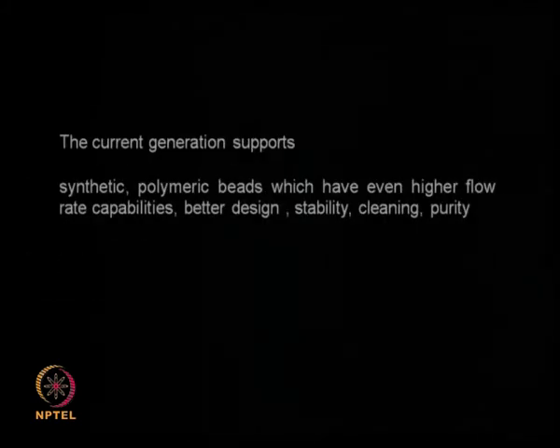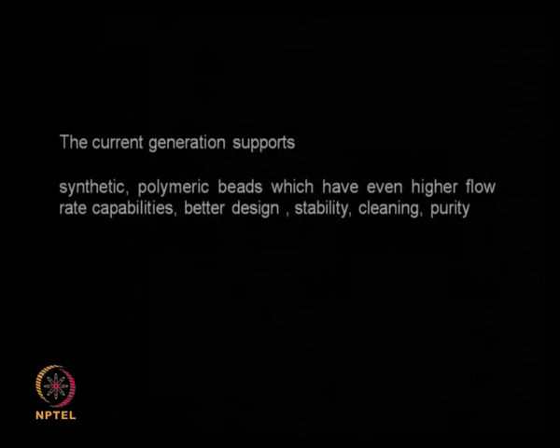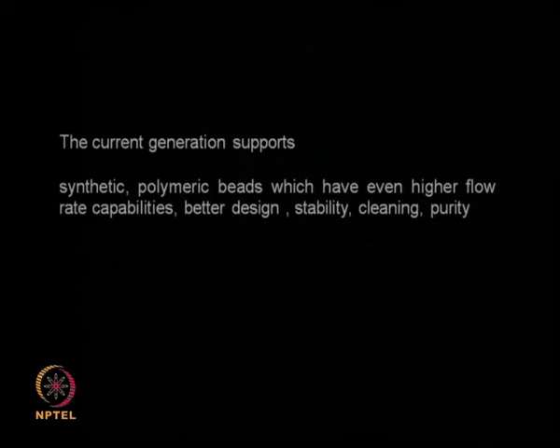Then as time moved on, they went into synthetic polymeric material, polystyrenes and different types of polymers, because we can achieve very high flow rate, we can have a good design stability, it is easy to clean, and we can achieve very high purity. So currently only polymeric stationary phases are used.